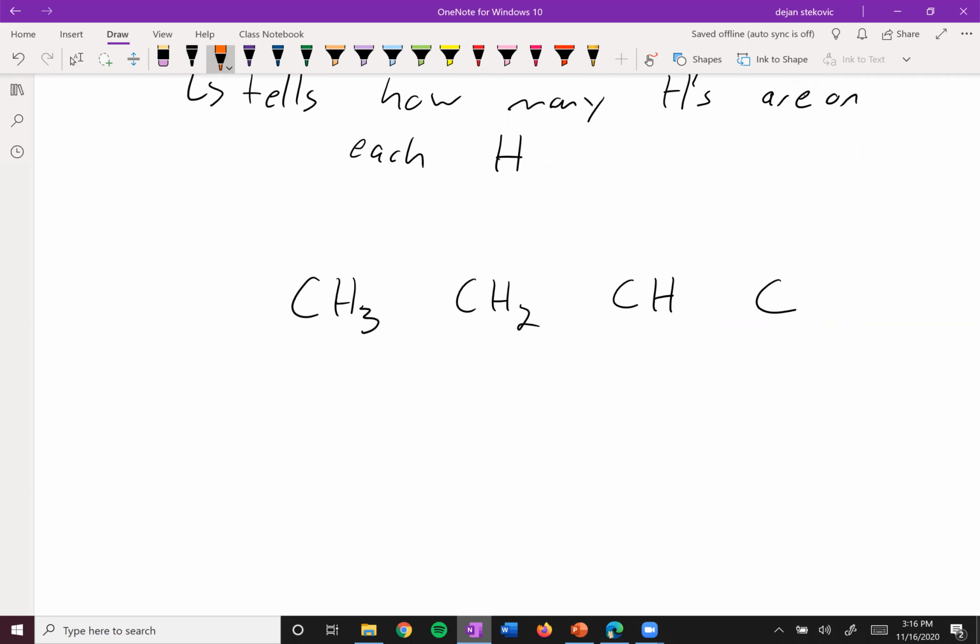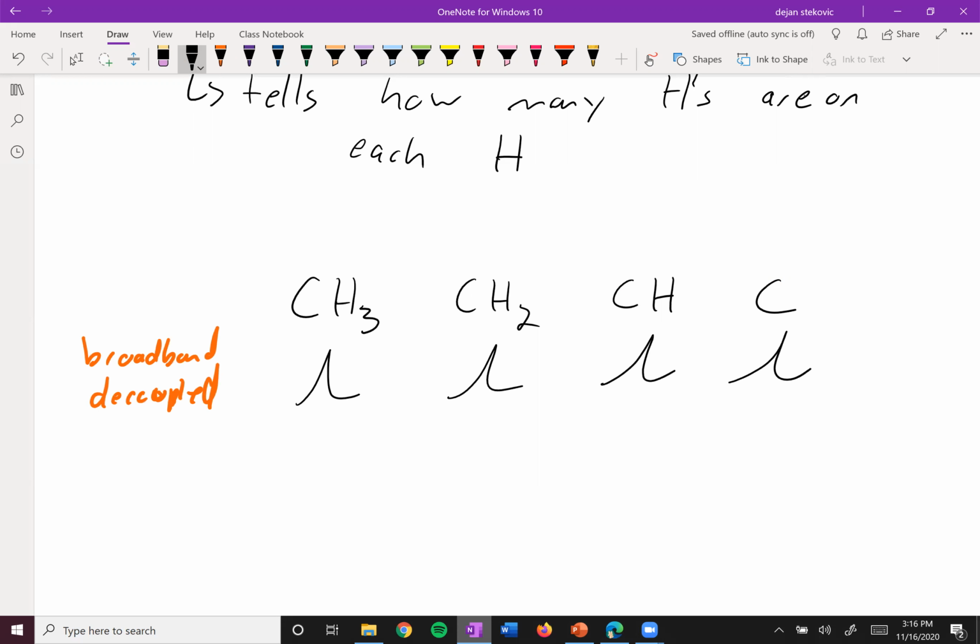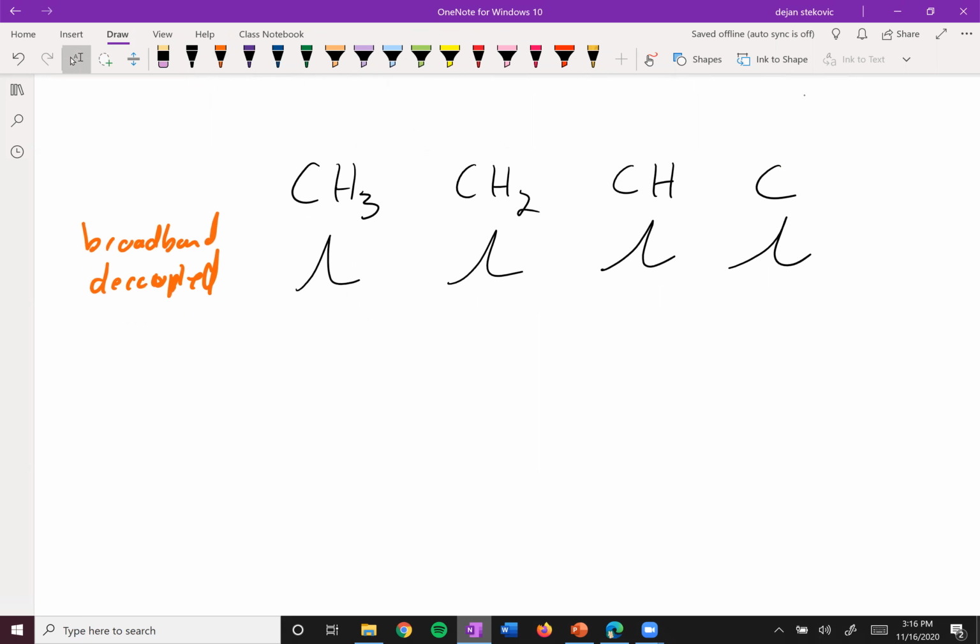The type of carbon NMR that we looked at previously is what's known as broadband decoupled. And so all carbons will show up as a peak there, right? All carbons will be visible. And then you can do other types of experiments such as DEPT 90.